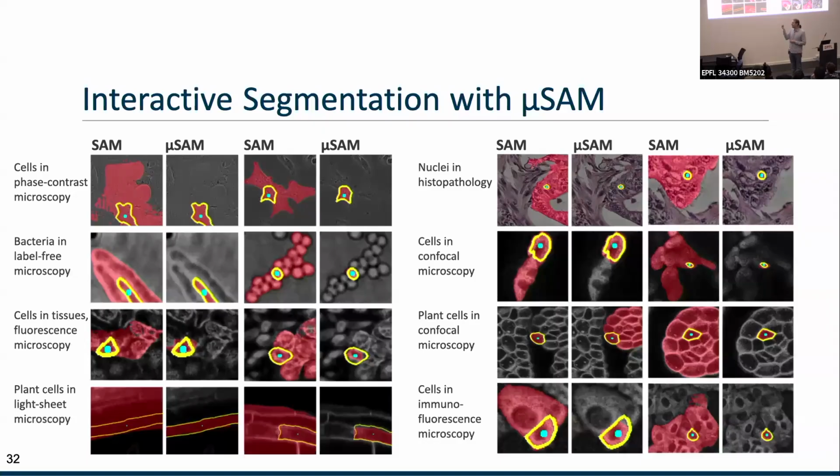And we do something more or less similar to what Cellpose does in there. Basically, we predict foreground, background, and then certain distances, and use a watershed for the segmentation. Because we found that what SAM did in the beginning, which is covering the image with a lot of different prompts, was just very inefficient, and this more dedicated solution worked better in the end.